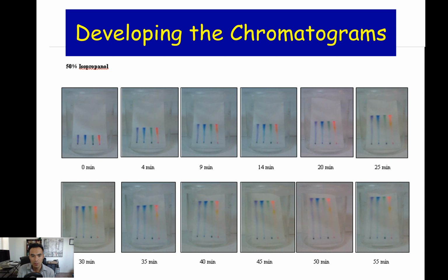If you take a look at, as an example, 50% isopropyl alcohol with a marker, what you want to really figure out is how far are the colors running to the top, and also more importantly which colors are having a little trouble. Now in this specific case, all the markers went up at the same time, indicating that the mixtures were composed of the same type of molecules, except that they had a little bit of change to indicate the color.